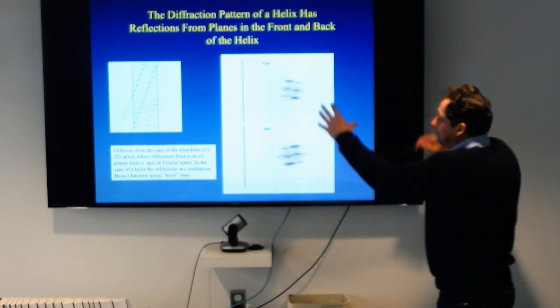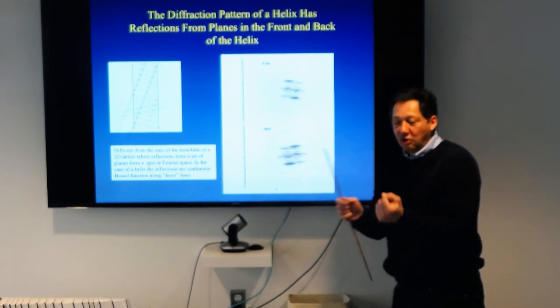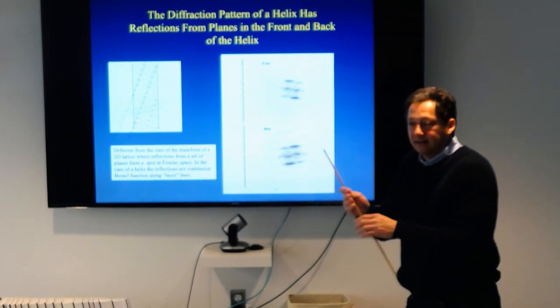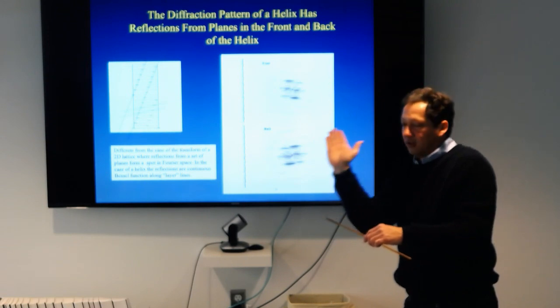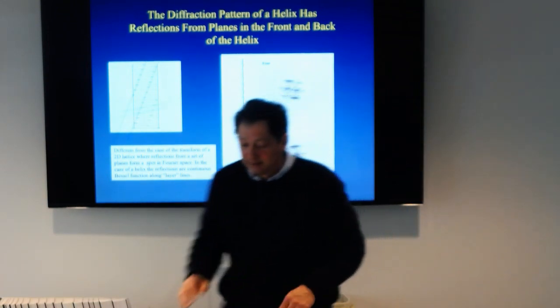But of course you have these two mixed, so you have to work by trial and error. If you put it in the wrong one, you realize that you cannot get a lattice, that you don't get all the points, the layer lines, falling into a lattice.